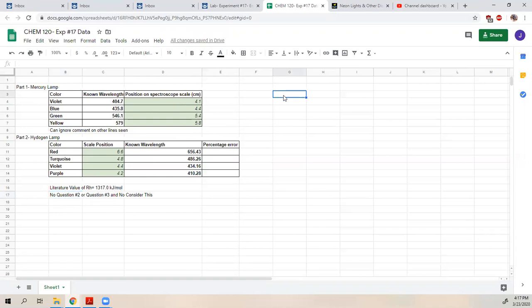Now, you are free to graph on your paper, or you can create a graph using your spreadsheet, either one. Now, the spreadsheet is locked, so you won't be able to use this specific spreadsheet to make your graph. But you can make a spreadsheet. Now, remember that for your graph, you need things like a title. You need your axis titles. You also need your units, right? You should have your scales for both axes. So that means that they have markings down there at the bottom so we can see what values they get.